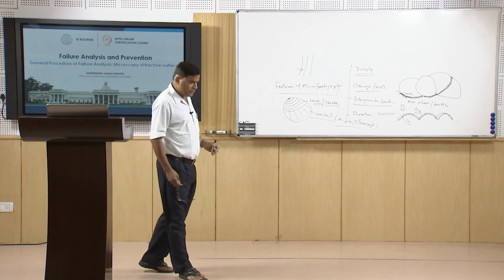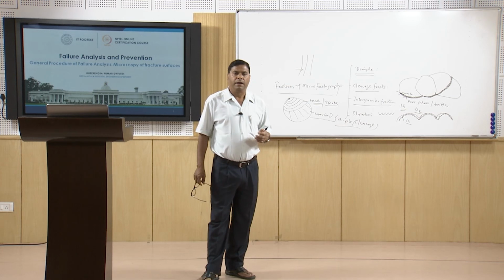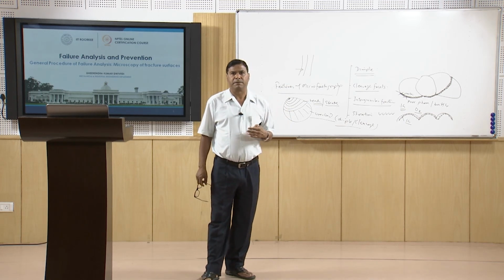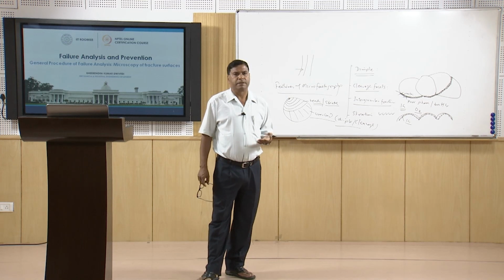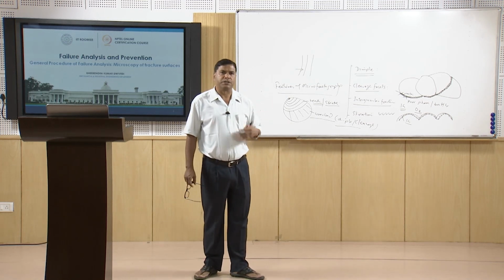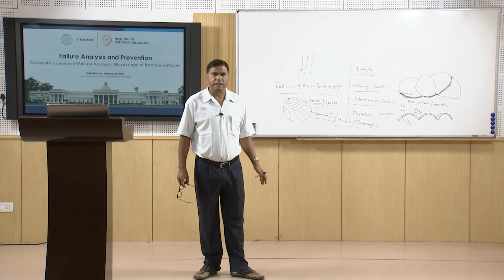Now, I will summarize this presentation. In this presentation, I have talked about the purpose of microfractography and what are the general microscopic fracture mechanisms or features which can be used to interpret the way by which fracture has taken place and the kind of loading conditions which were experienced by the component during the fracture. Thank you for your attention.